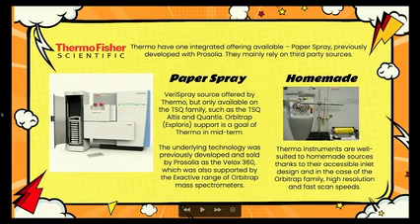And they're hoping to include support for the Orbitrap family, specifically the Exploris family, at some point in the sort of mid-term. So it's not imminent, but it's a goal of theirs. But it is supported on their TSQ family.